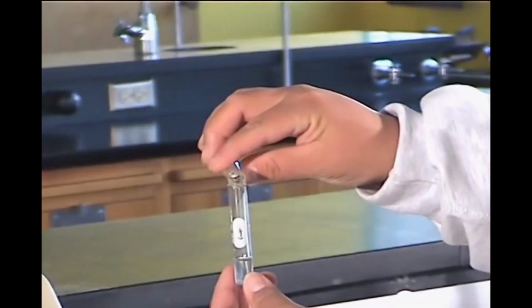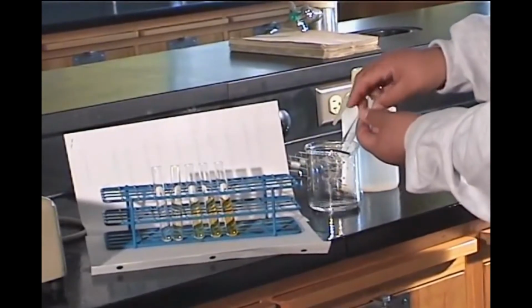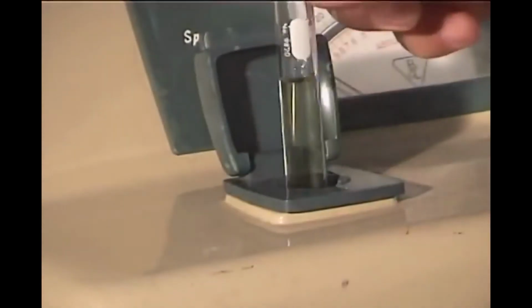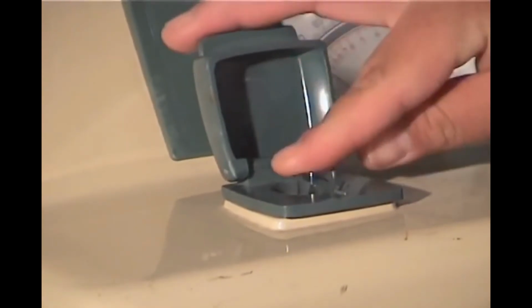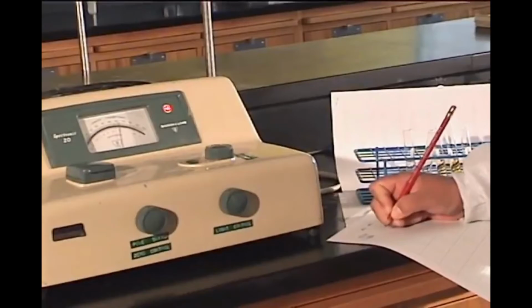We then pour the control solution back into its own test tube, rinse out the cuvette, and add the lightest colored sample to the cuvette after rinsing the cuvette with a small amount of the sample. We insert the cuvette into the instrument, always with the test tube's label pointed toward the front of the sample holder, close the top flap and record both the transmittance and the absorbance.